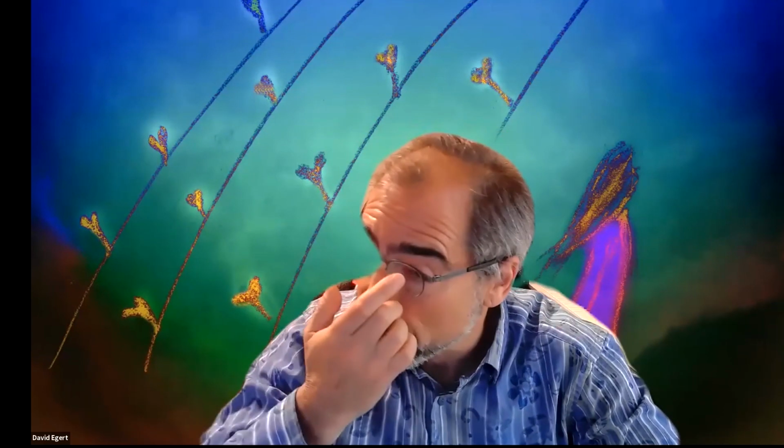They're all filled with 1.5 molar sucrose. And then we put those sausages, which are about the size of a little hot dog, into different solutions. We put one into distilled water, one into an isotonic solution, one into a hypotonic solution, one into a hypertonic solution. We put one in this really sugary solution, and let them sit there and let you poke at them with a glass rod so you can really feel what it is like to have something sitting in a hypotonic versus a hypertonic versus isotonic solution. So you have a hands-on feel rather than just doing it virtually.